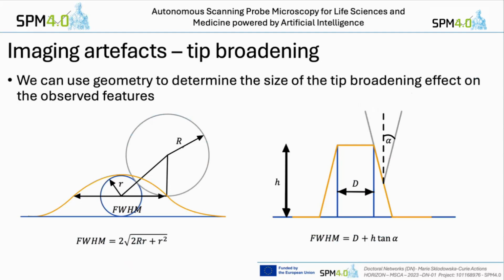And historically, it is quite difficult, especially when your sample isn't a very defined width. So if you're imaging something like a meshy network where all of the strands have different widths, it's quite difficult to define it. Whereas certain samples you can define a lot better.